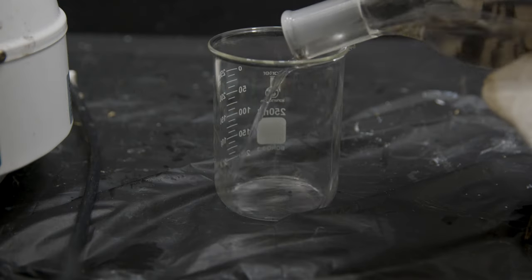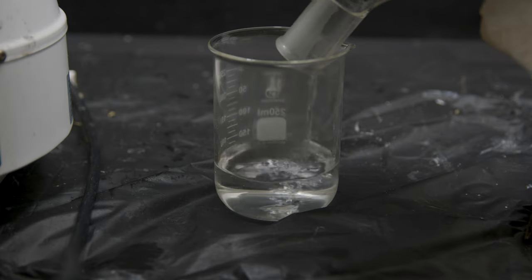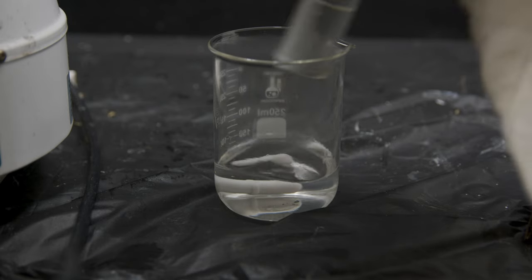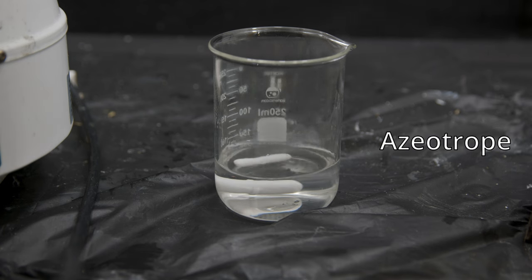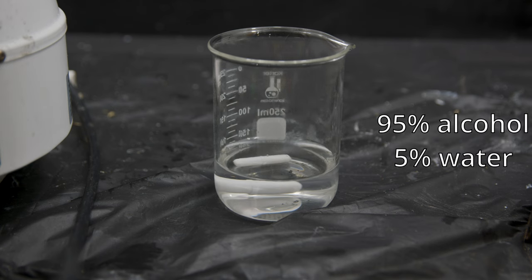Now you may be wondering why did I stop at 95% alcohol and not just do the full 100%? Well that's because water and alcohol form something called an azeotrope, which basically means you can only get it up to a certain percentage, in this case 95, and you can't distill it any further than that.